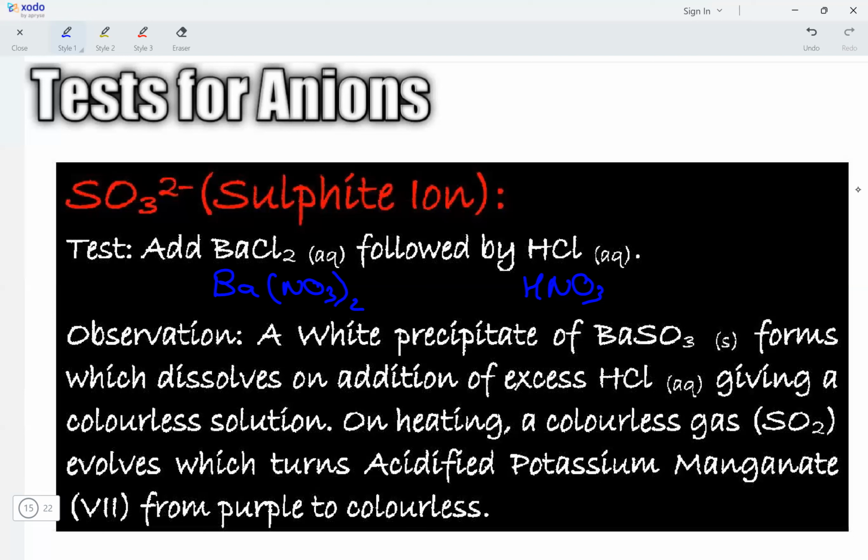So now we had sulfite ions present. Potassium manganate converted sulfite ions into sulfate ions. This can be tested further. Again in this very same test tube, if you add barium chloride or barium nitrate, a white precipitate will form. And now when you add HCl or HNO3, this white precipitate will not dissolve, indicating the presence of sulfate, which was not there in the beginning.